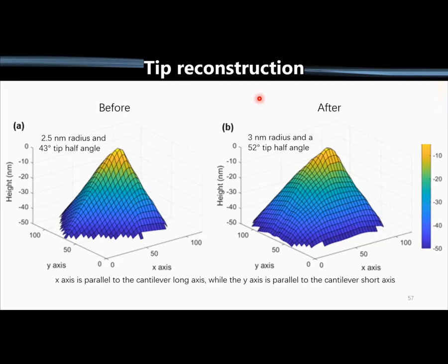Okay, thank you. So one suggestion is related to the quality of tips and maybe the combination of current and voltage which we are using for this. This may be the reason.